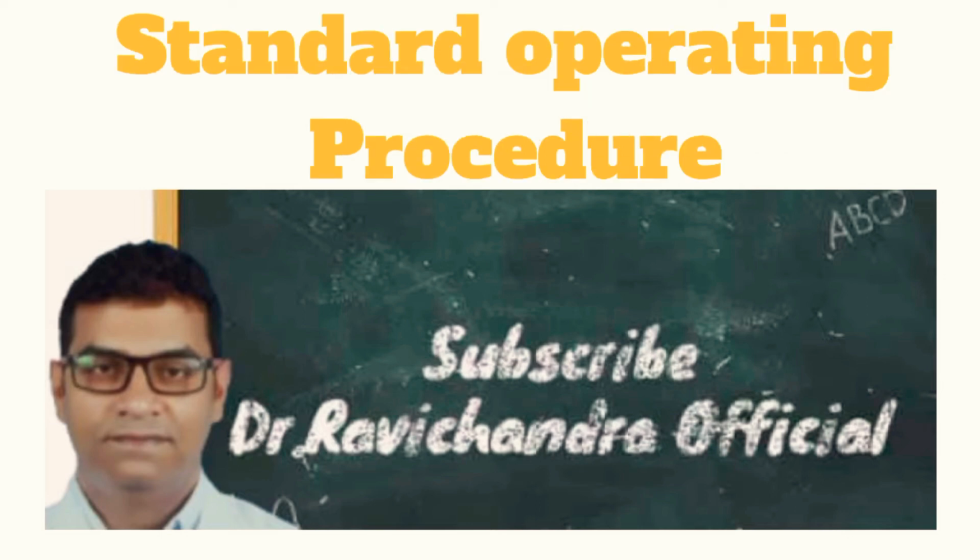Tube 1 is not used for routine testing. It is useful for comparison of color or turbidity if a traumatic tap is suspected. Tube 2 is used for chemistry and microbiological testing. Tube 3 is used for the cell count and for visual observation for color and turbidity. Transfer a small amount of the fluid to an EDTA tube and gently mix. This will be used to perform the cell count. Tube 4 is saved for reference testing if requested, and frozen if additional testing is not requested.